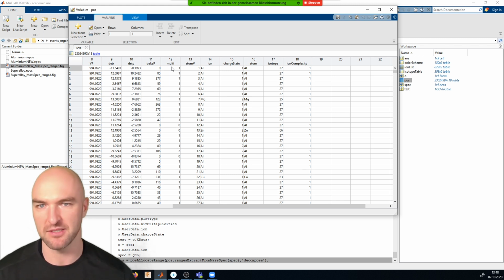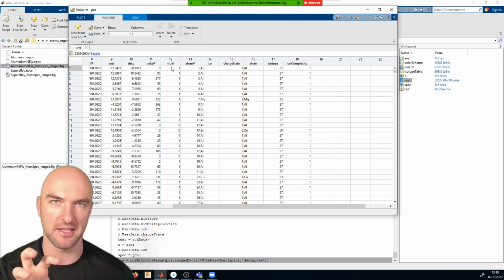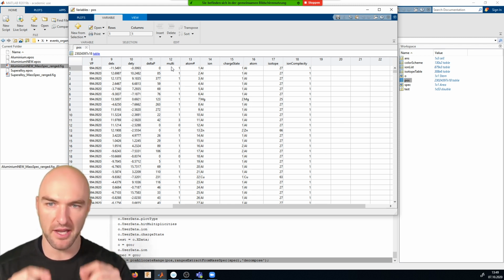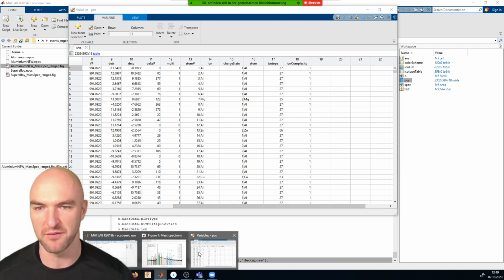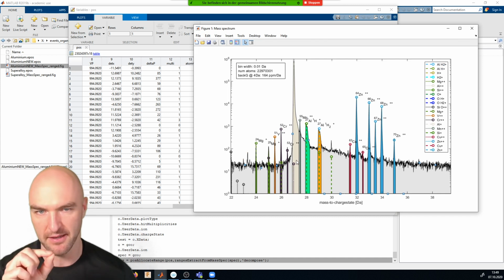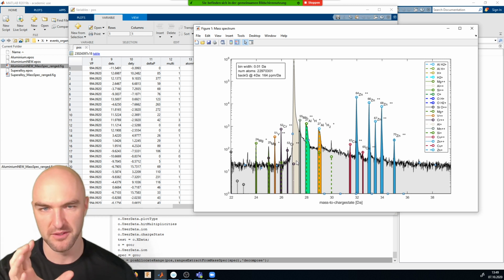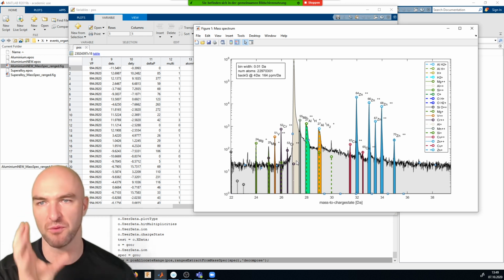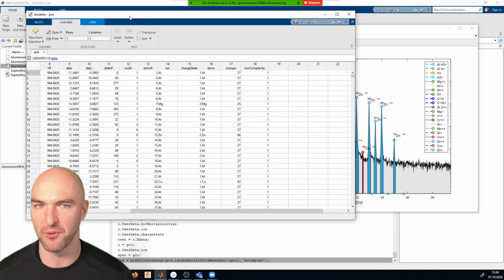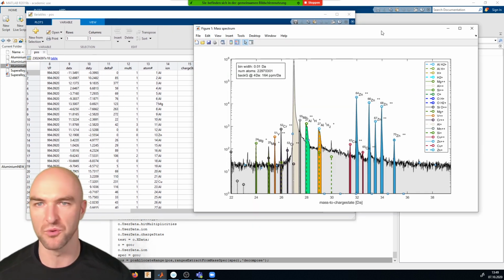What you will see later is obviously that we can also determine concentrations not on a per ion basis, but on a collective basis. So you have a variable with tens of thousands or millions of atoms in it, and then you can use additional information, for example, about ion overlap. For an individual ion, you need to make a decision of what that would be. But if you have collective information, then you can do things like deconvolve and so on and so forth. And you will see that the basis for that is a very important foundation of what we do in our toolbox.